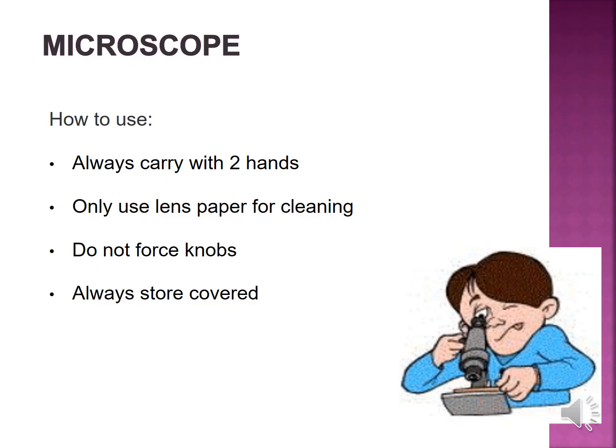So how to use a microscope? Always carry it with two hands. Only lens paper should be used for cleaning. Do not force the knobs. Always store it properly.